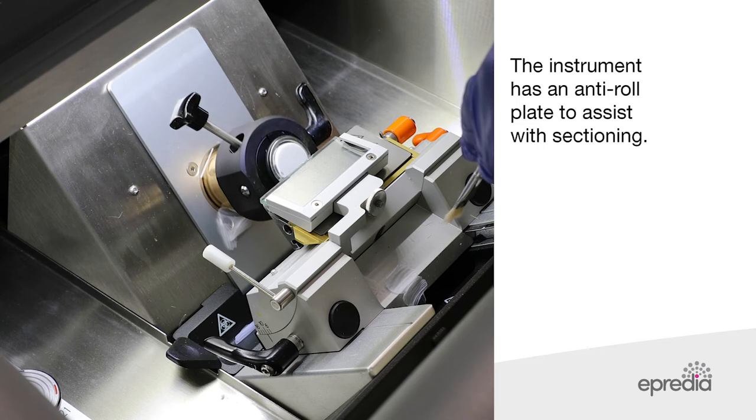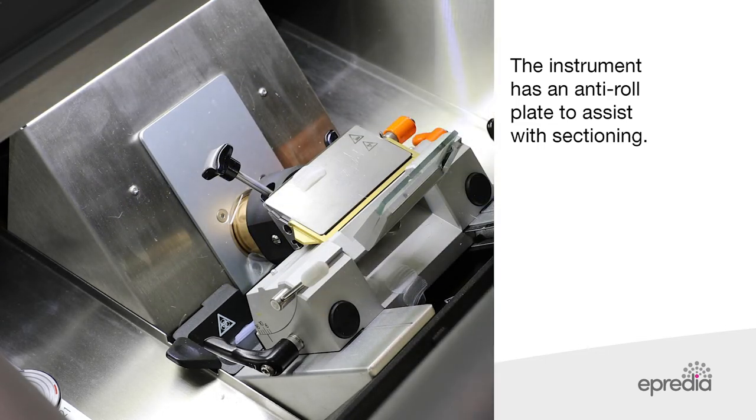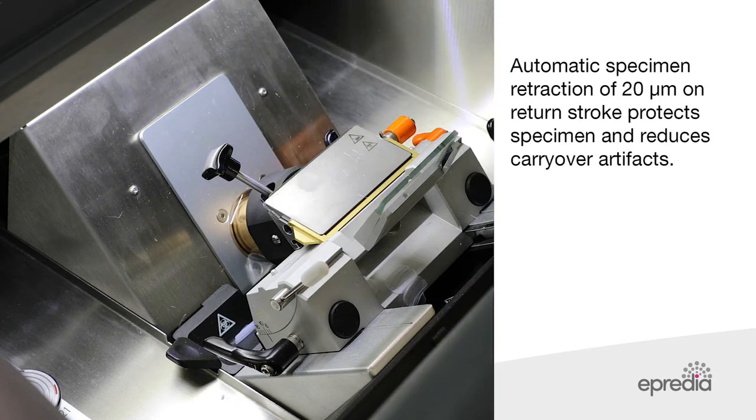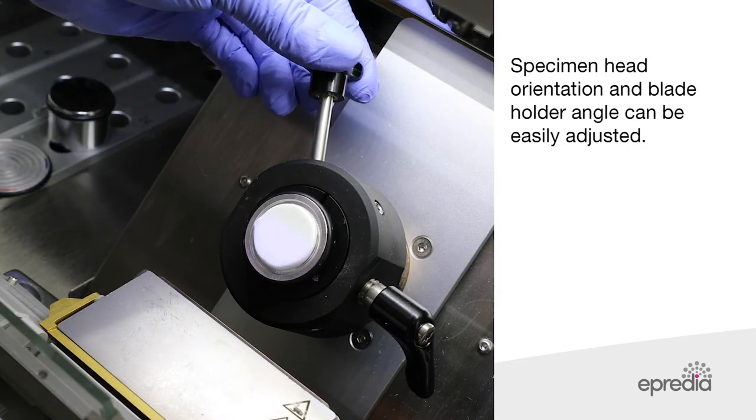The instrument has an anti-roll plate to assist with sectioning. Automatic specimen retraction of 20 micrometres on return strokes protects the specimen and reduces carryover artefacts. Specimen head orientation and blade hold angle can be easily adjusted.